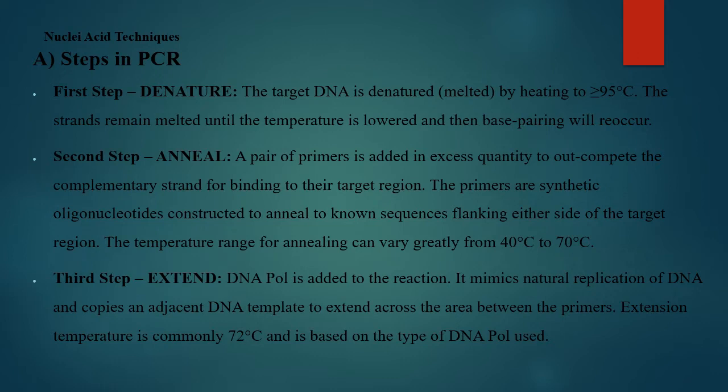Then the third step is the extension. Once the primers have bound to their requisite position, then your DNA polymerase is added to the reaction.